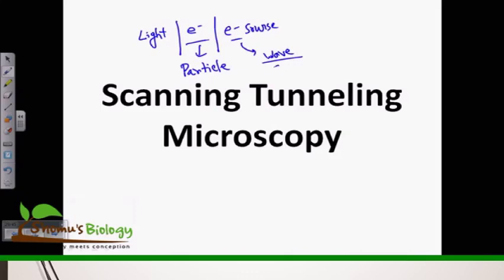So this is called quantum mechanics. The principle that we use in scanning tunneling microscopy is the quantum tunneling effect, the law of quantum physics, right? Because the electron can behave like a particle.